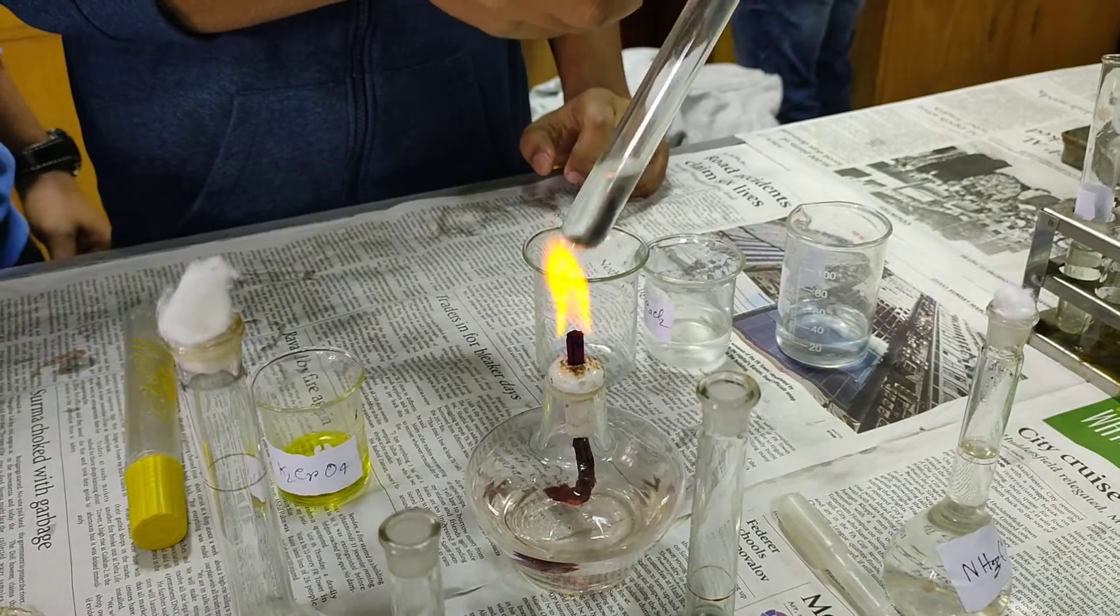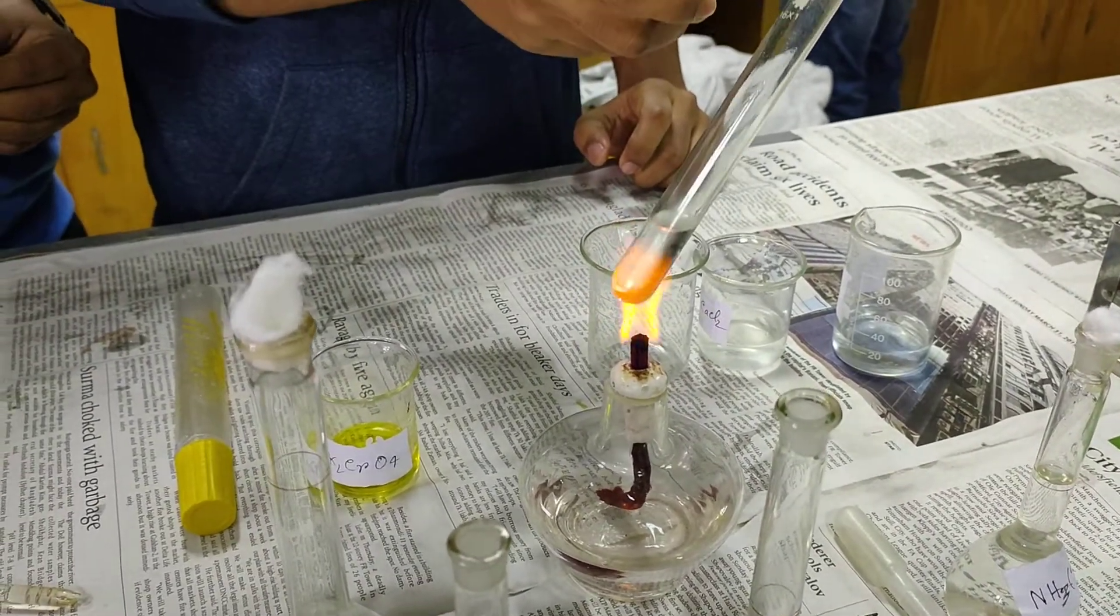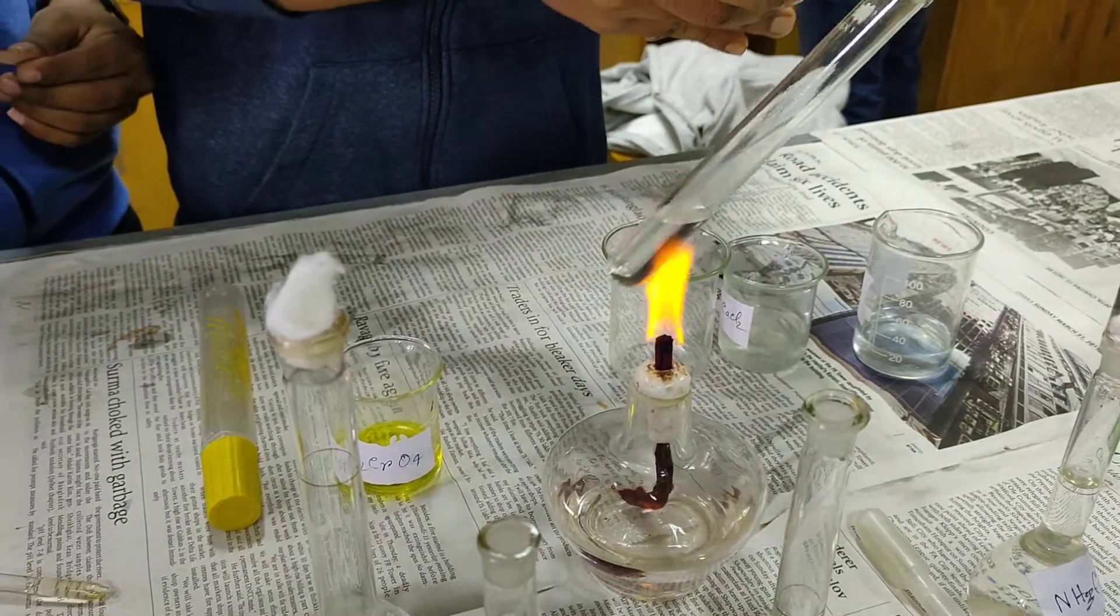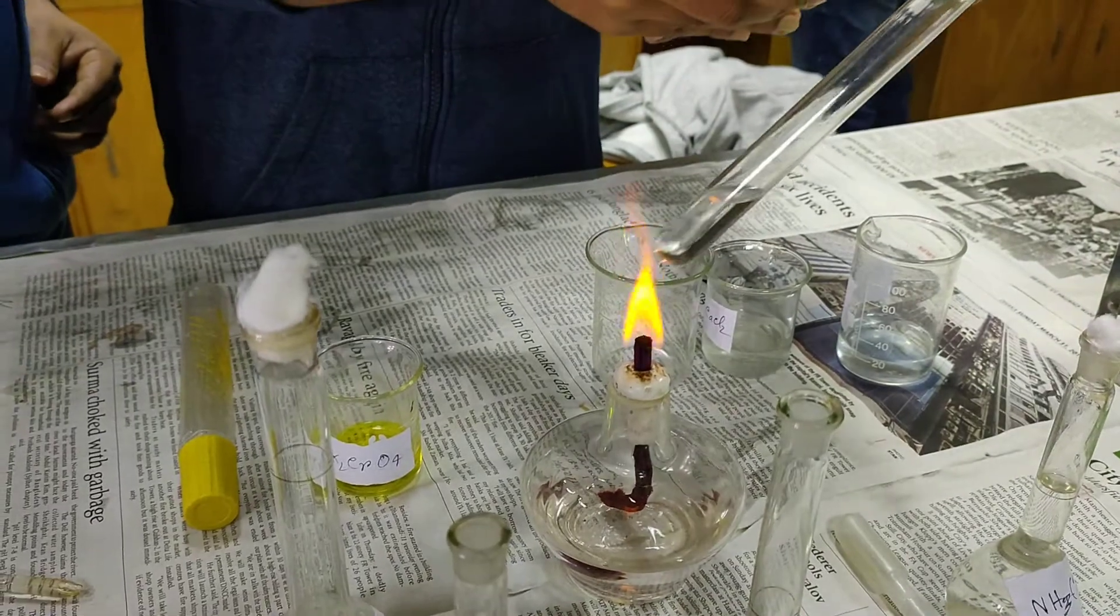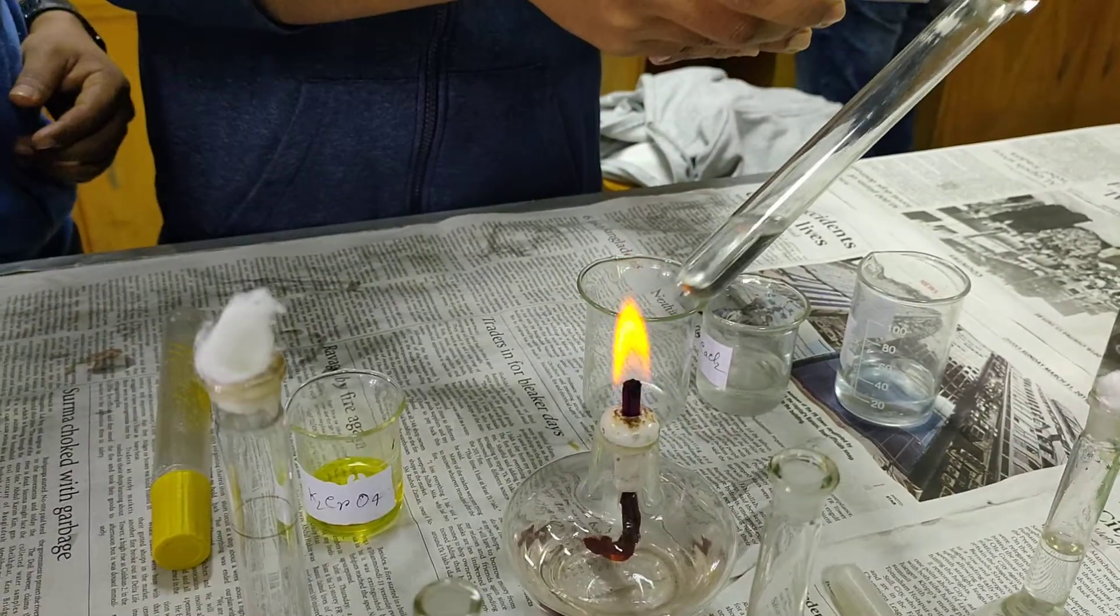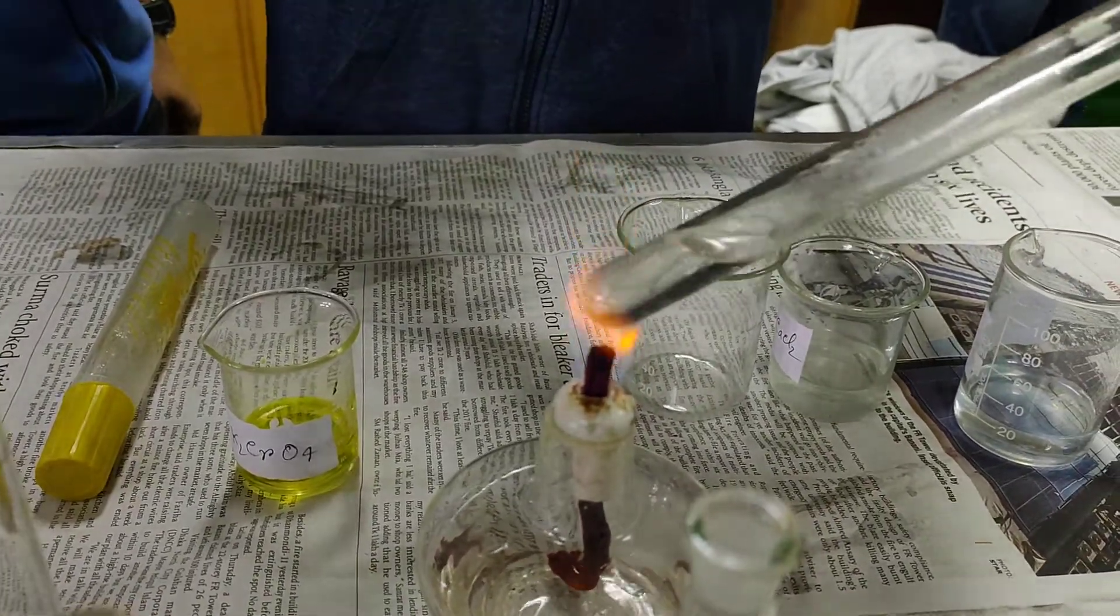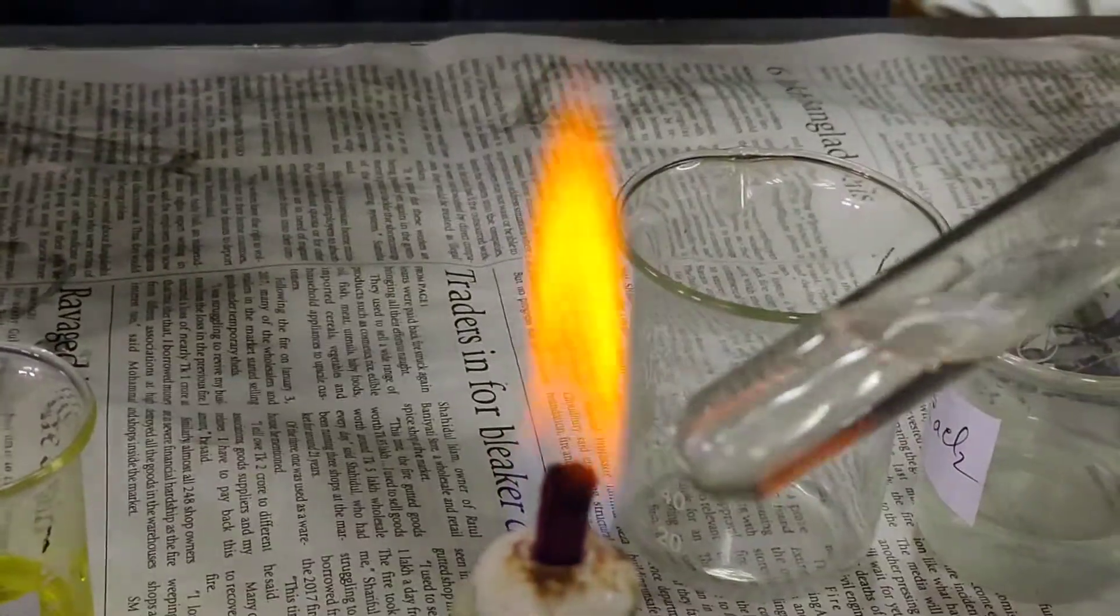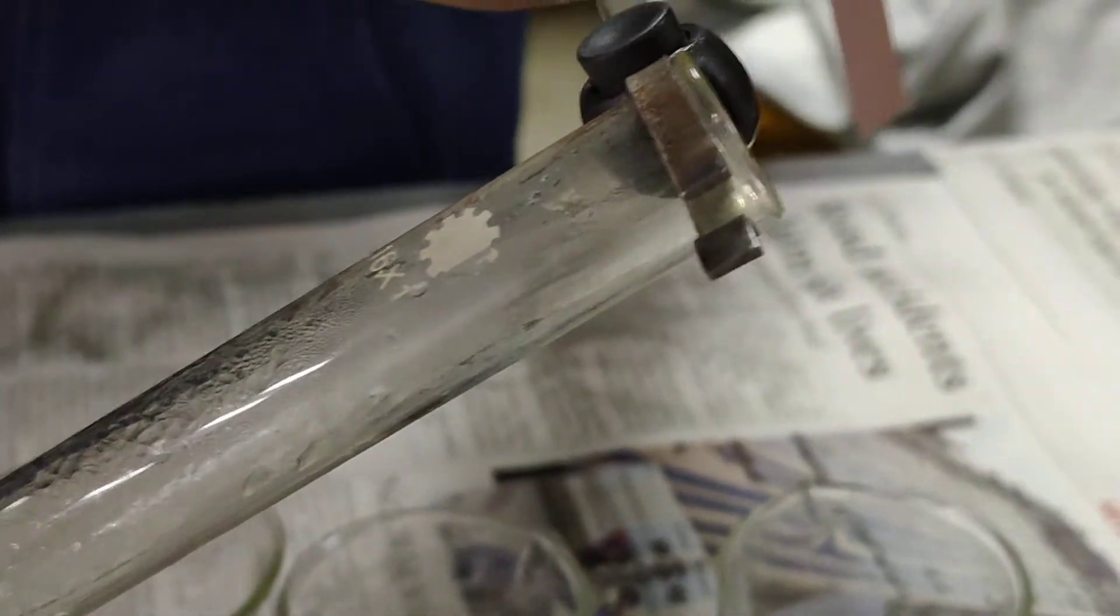We are heating the test tube. When the gas evolves, this gas will turn red litmus paper into blue. After heating, when the gas evolves, it has an ammoniacal smell and it will turn red litmus paper into blue.